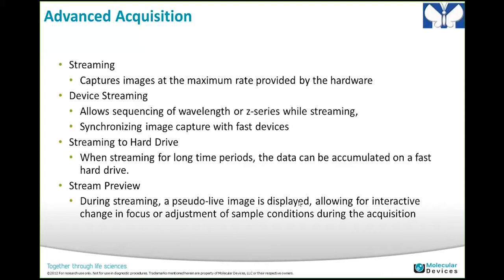You have a stream preview, which during the stream is kind of pseudo-live, so you can update the image window as it's streaming to see what's going on. There are ways of changing how often that update happens. So you have those configurations.